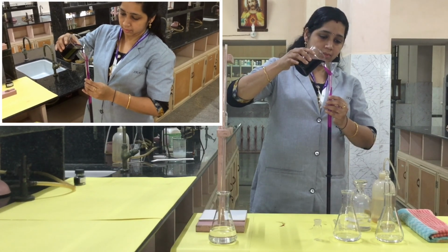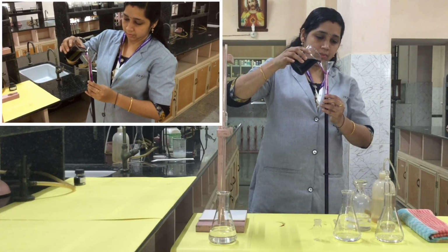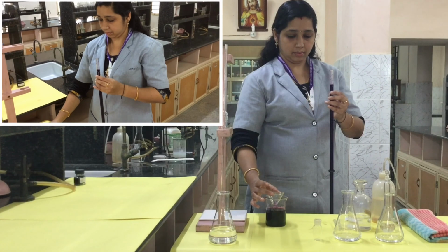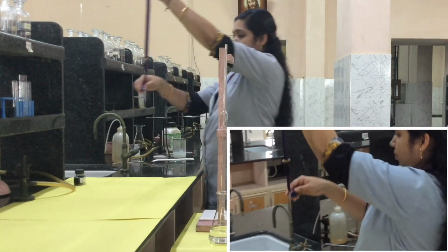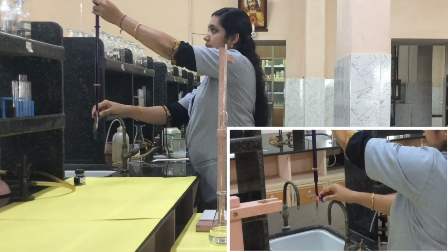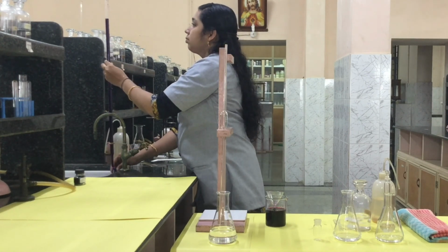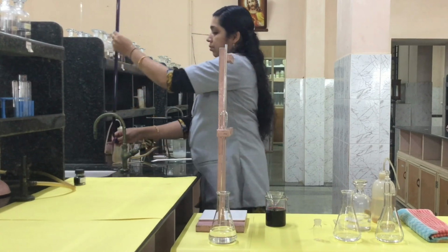Just check whether the burette tap is closed or open. First you check that, after that you fill. Tighten the burette and then fill up to the mark on the burette. You can see this 50 ml, right? So that you fill. And take care while you fill the KMnO4 in the burette that the nozzle must be filled. Please check whether the nozzle is filled or not. Fill the nozzle, then after filling, check whether the level is reached or not.